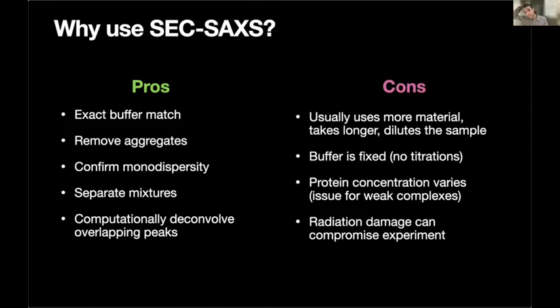So the disadvantages, though, this usually uses more material than a standard SAXS curve, a single SAXS curve, because the column tends to dilute the sample.